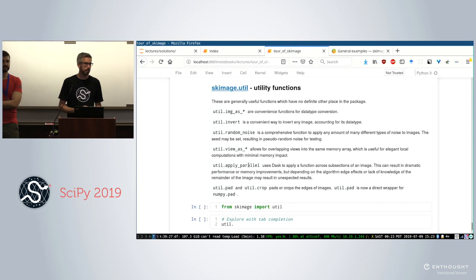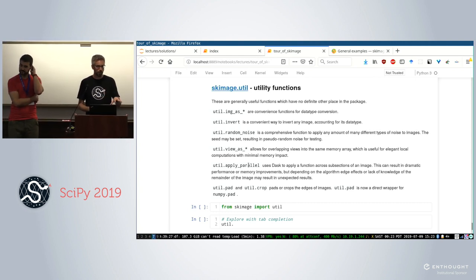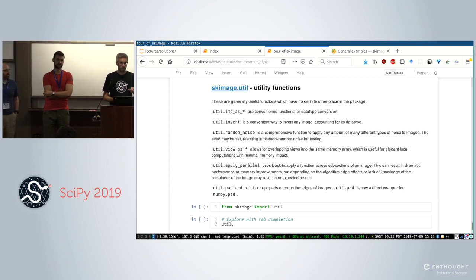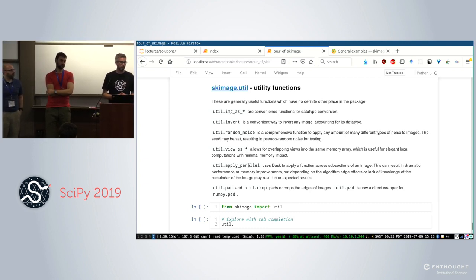There's a lot of lecture material in the repository that we didn't get to today, but there's a three-dimensional example that's linked from the front page. So that one might be worth checking out. It's a cell volume where we segment out the different cells and then visualize them.